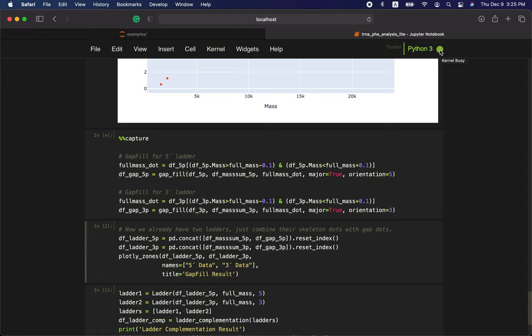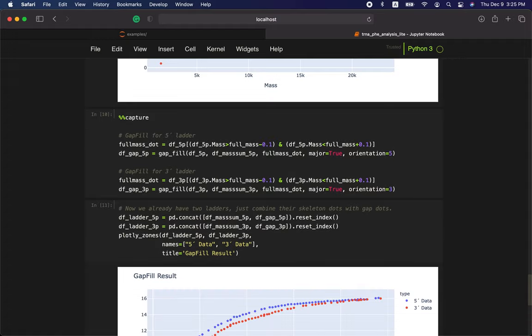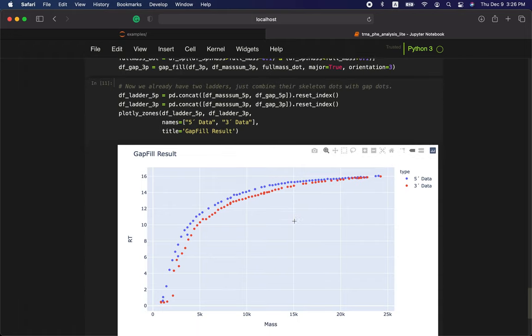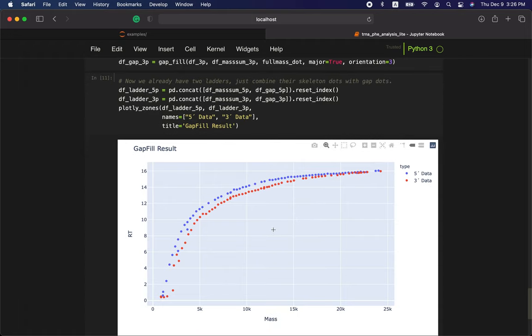Here's the other part. Here's the question. Alright, this cell shows the result of gap fill.